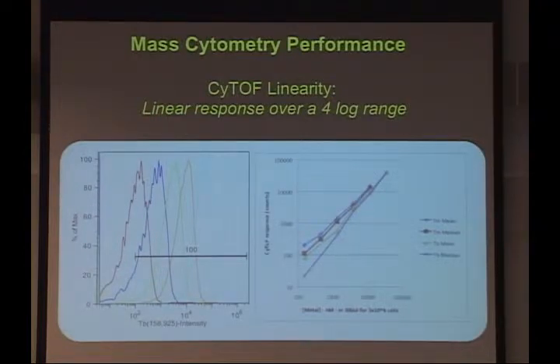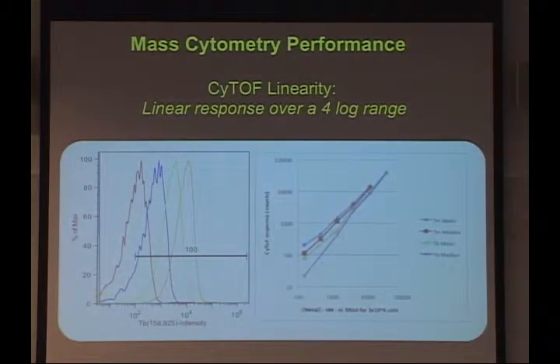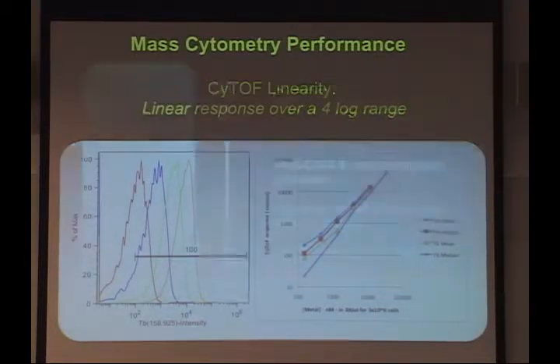And that doesn't always happen in fluorescence. Theoretically, our LSR II measures up to 10 to the 5, but it's not really linear over 10 to the 5. It does start to saturate. I mean, this will start to saturate too, but the other thing is our counting does actually start at 1. So when you put the blank cells through, there really is no background that comes up. So this is handy if you have things that you can measure in this range.